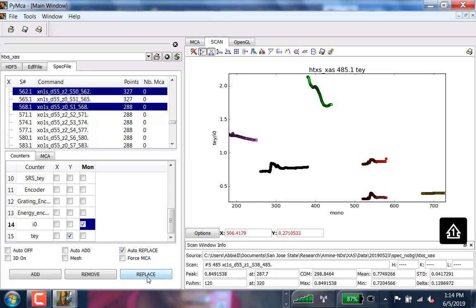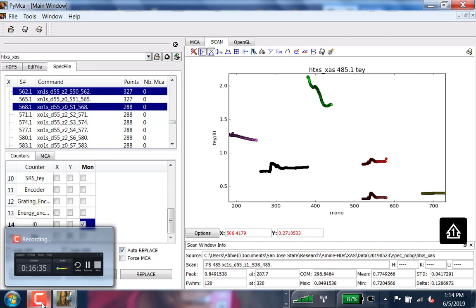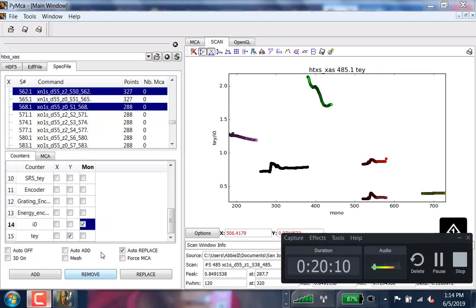And if we've got some amount of adsorbed water, we should see it. Its only signature would be through oxygen. Right, because hydrogen we don't see. Now we can see carbon-hydrogen bonds, boron-hydrogen bonds or nitrogen-hydrogen bonds, but we cannot directly probe hydrogen. All of the elements in that first row that can bond with it.